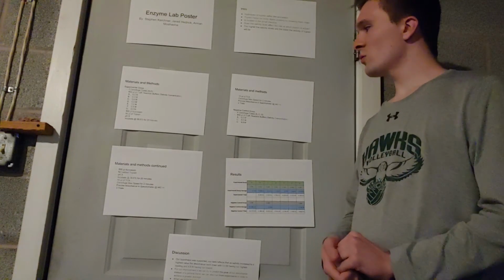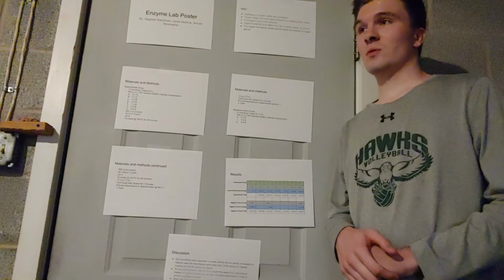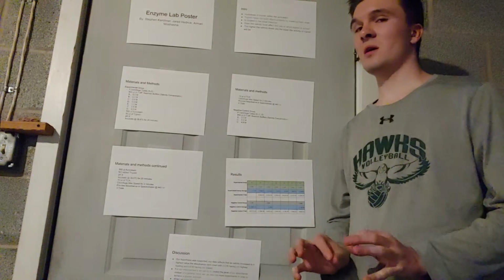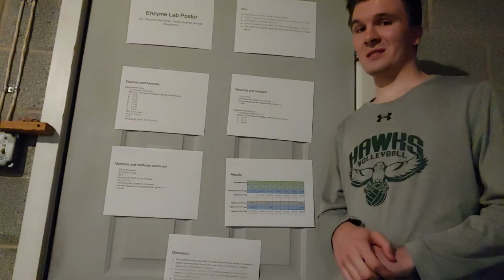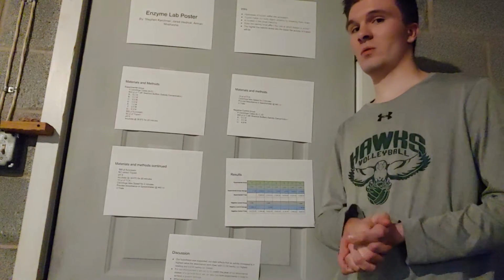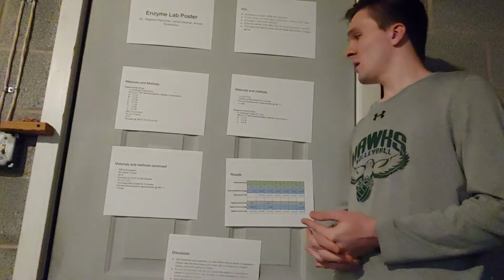For our negative controls, we did 3 centrifuge tubes, and we did 3 trials of that. We found it useful to do 3 trials. Again, we were pretty sure of the negative control because we know the actual effects of trypsin, but just to make sure we had that in there, we did 3, and we did it at 3 different salinities as well. We did it at 0, 0.6, and 4.8. So kind of the extremes of each end, and then a middle spot that we thought was a comfortable position for it to actually, if it was going to produce any trypsin, do that.